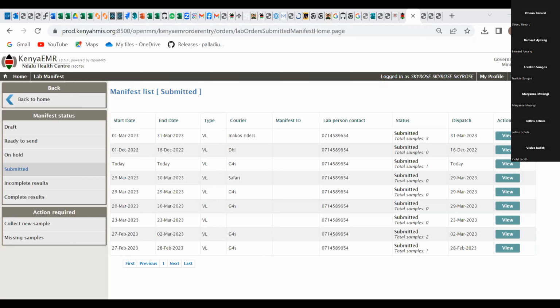The one from Patrick is 400 and 500, and according to him, they're very common. Probably Otieno or Marihan would comment on this. What would be the cause and what would be the remedy? Because I think that's the most important bit.